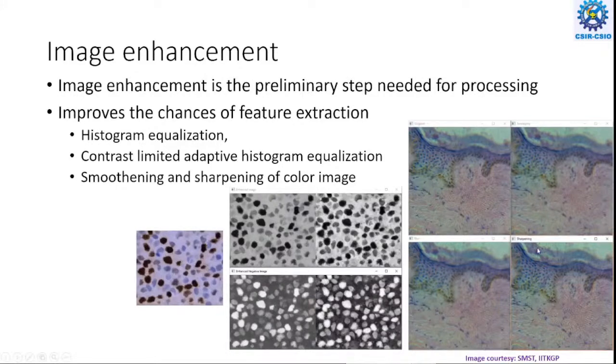On the right half, we are applying smoothing and sharpening of the image. For the same image, after smoothing, the edges are deteriorated and a smooth image is represented here. While on sharpening, the edges are sharpened to get a better representation of the image. These are used for any kind of pre-processing before segmentation and other approaches.